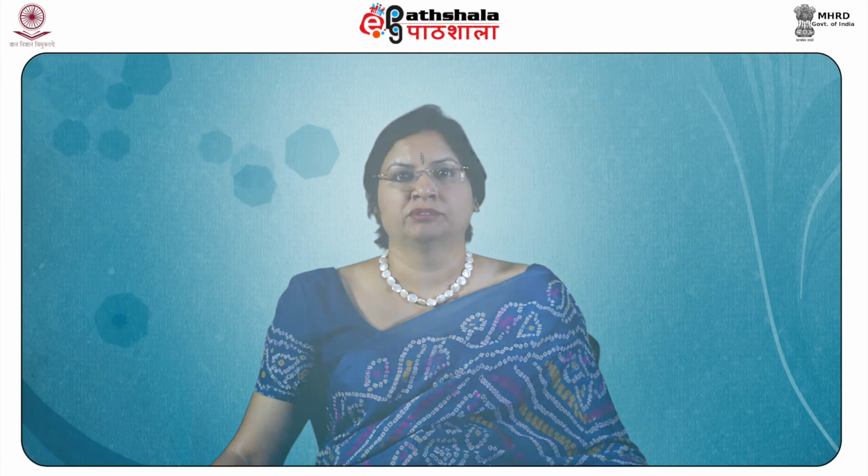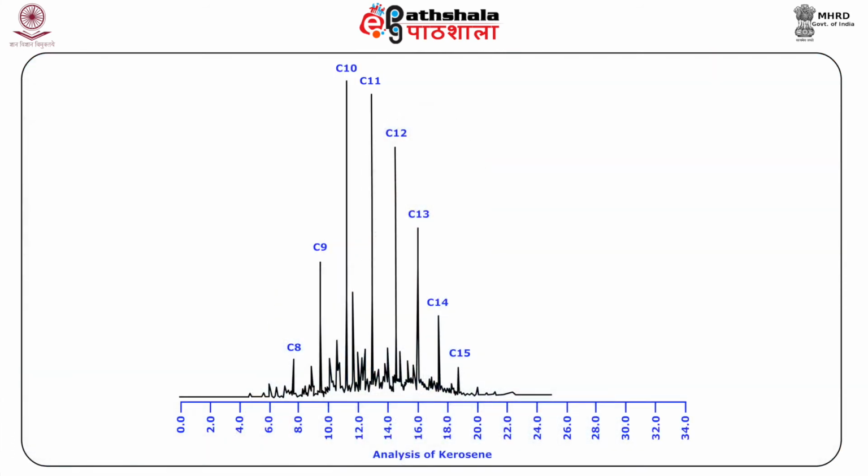On the other hand, if we look at a typical gas chromatogram of kerosene, you can see the peaks are of different shape, but here also there are multiple peaks. Another thing is the positions where the peaks appear, which have to be matched with the sample that you have collected from the crime scene, so that you can say whether it is kerosene or not. And different grades of kerosene can also be compared, to tell which particular kerosene has been utilized.